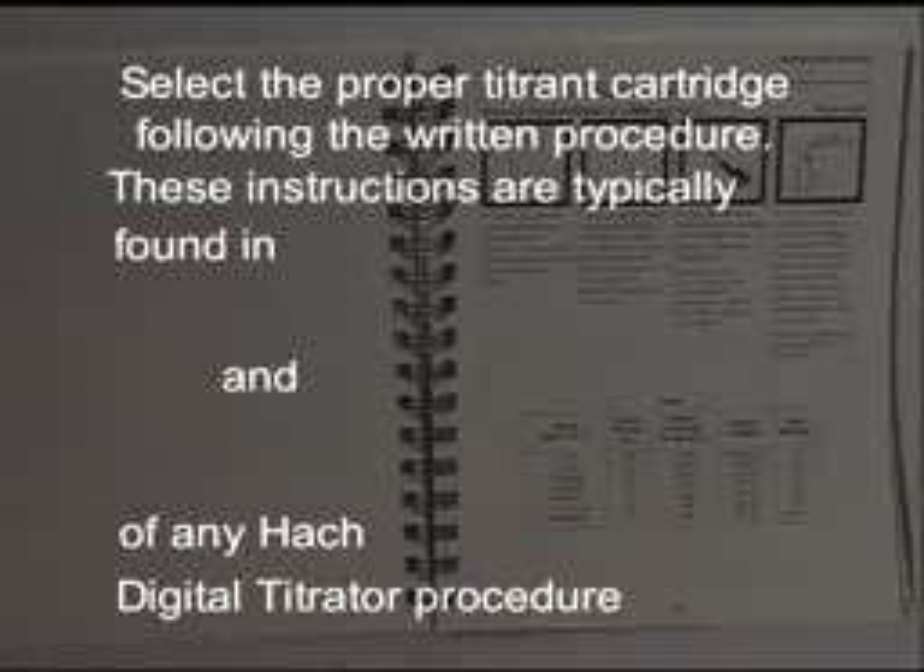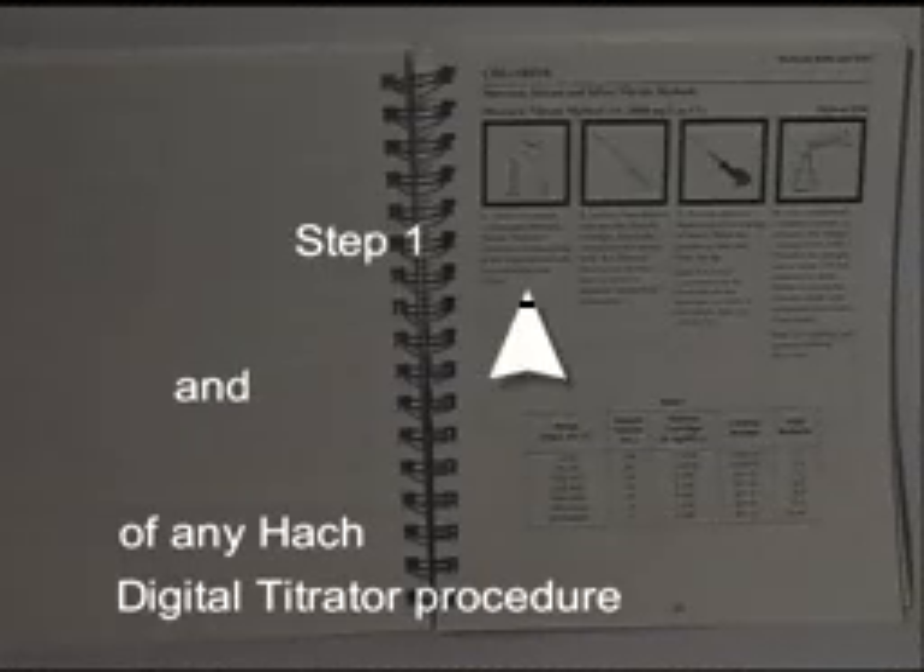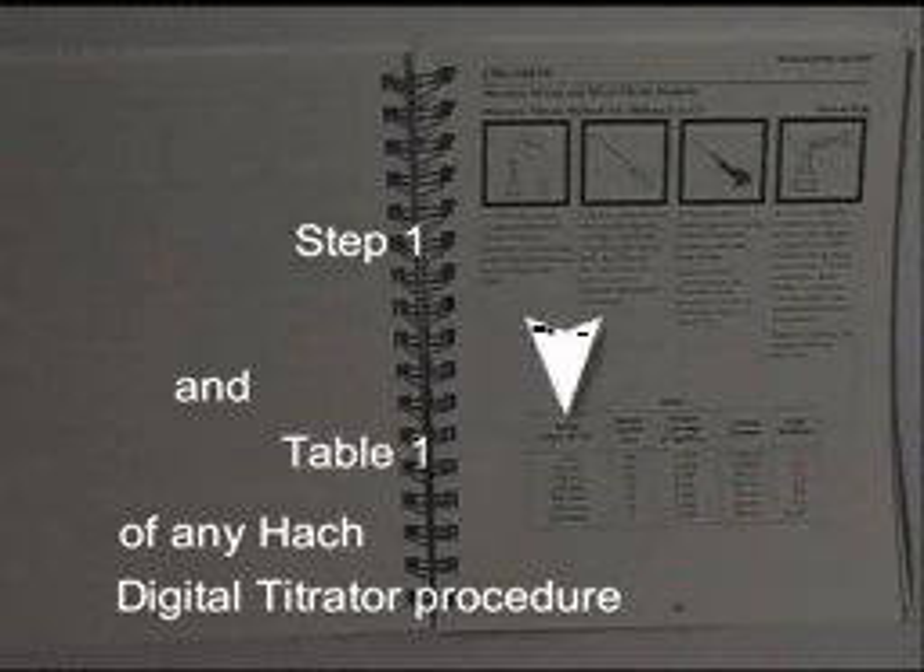Select the proper titrant cartridge following the written procedure. These instructions are typically found in Step 1 and Table 1 of any Hach digital titrator procedure.